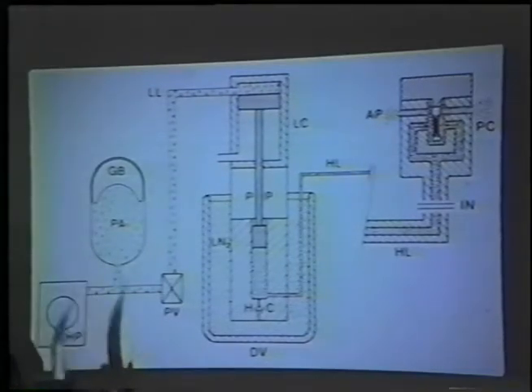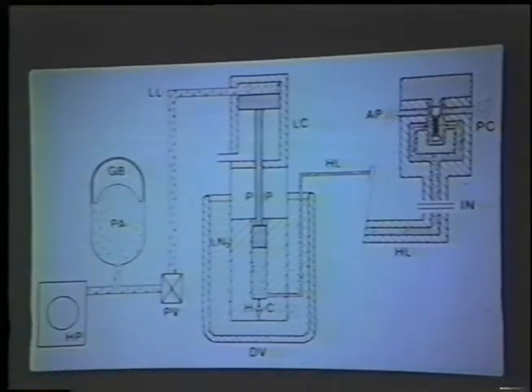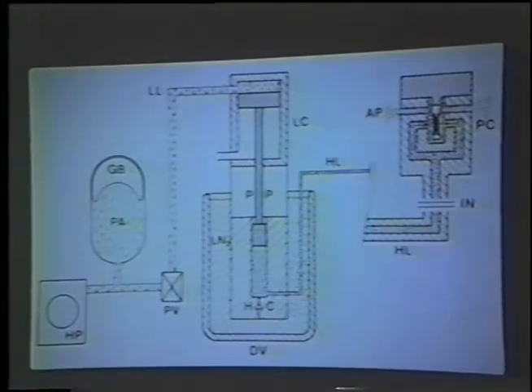from the other. The sample holder, in this case, has a bottom portion in which you build the sample and then a hinged leaf that goes over. And you screw that into the rest of the handle, and that holds them together. The leaflets were able to separate, therefore the sample carriers were able to separate, and the sample got blown out from between the hats virtually every time. When we first got the machine, we froze 14 samples of fish intestinal tissue, ended up with one still between the hats.